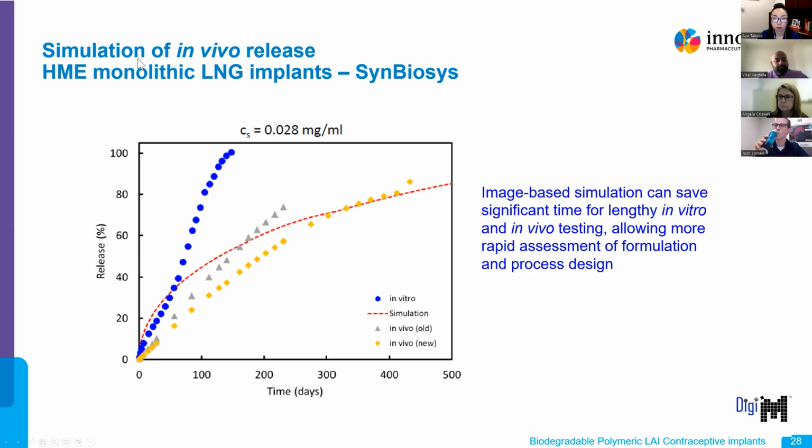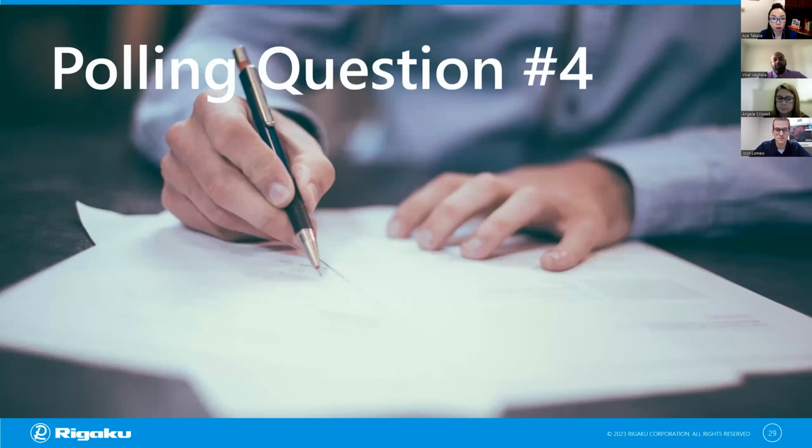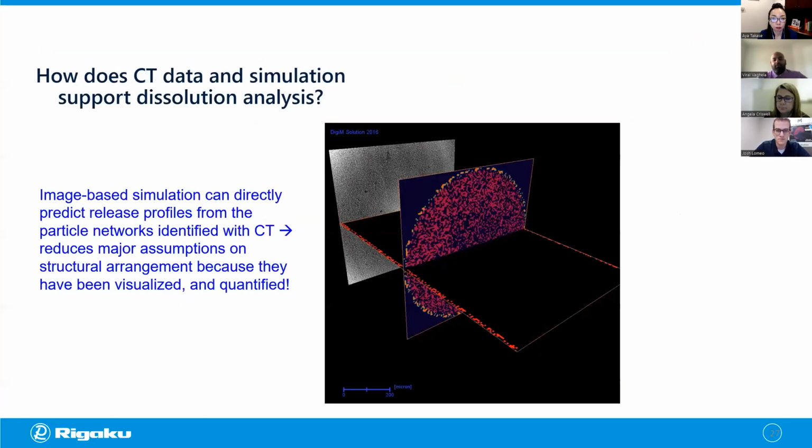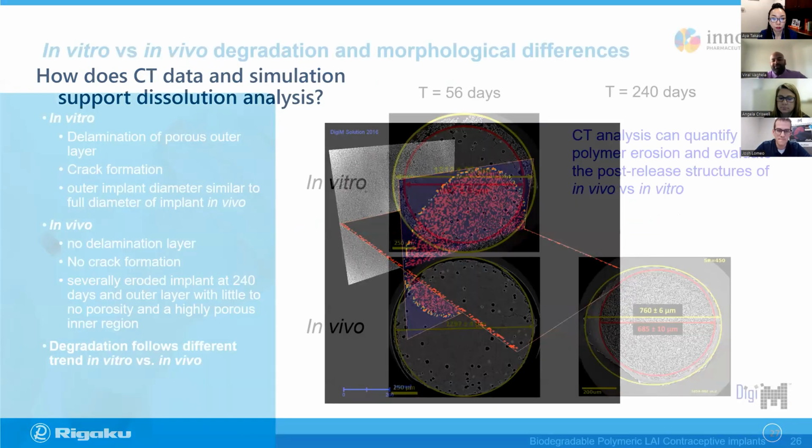I don't have a question, but I'll ask one. It was really interesting when you were mentioning the case with Eli Lilly and the poor connectivity on T1 and T2. Do you think that could have been solved without X-ray CT usage?